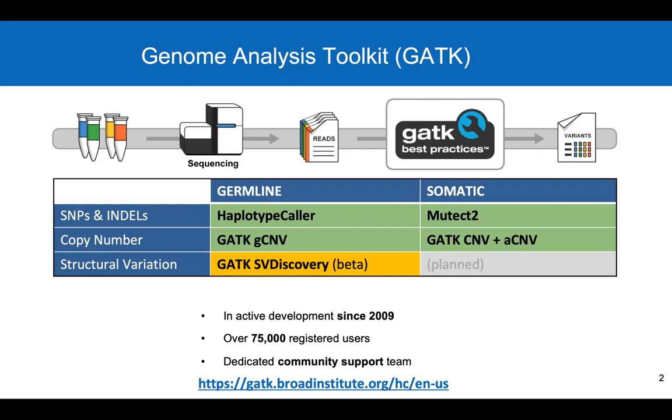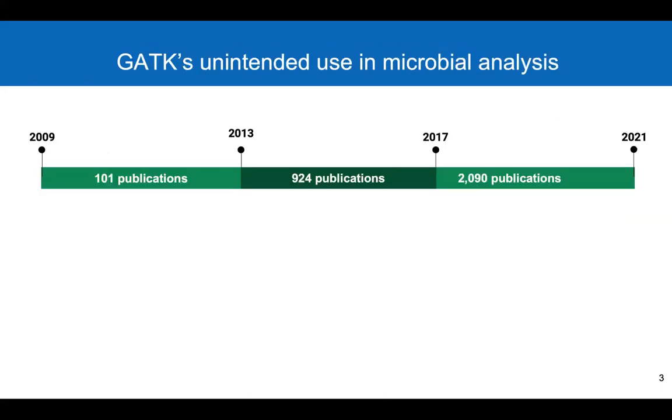However, GATK was primarily designed for human data and was not envisioned for microbial genomes. Despite that, we noticed that the community was already adopting GATK for microbial variant analysis. Here is a timeline of the number of papers published on microbial research that use GATK.